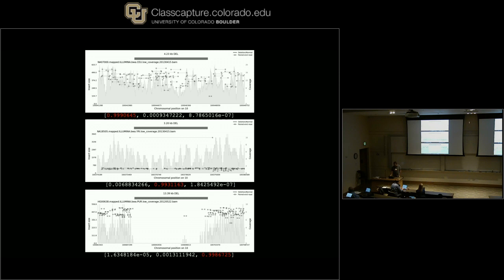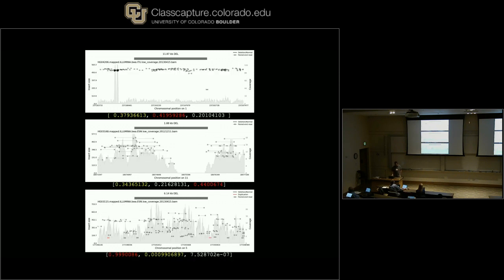So my guess is, and this is one of the things we're trying to not just guess about but actually pull out of the model, that it got thrown off, like you're saying, because the coverage is a little funky, and for some reason these reads are very high. All right, so in the second case, the called genotype was reference, but the model predicted there was actually a 2-copy loss. So what do you think it was keying on here?